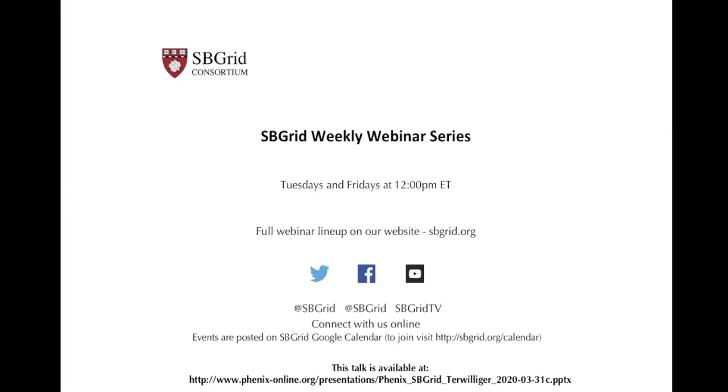So a sort of related question: things like nanodiscs or big complexes, do you have any recommendations around special sample types, or is this kind of general, nanodiscs work, viruses work? Yeah, actually, I would say the simpler the system, the more likely it is to work. Nanodiscs are a little bit problematic in that they have different components in different places, and the densities in those different components are not uniform.